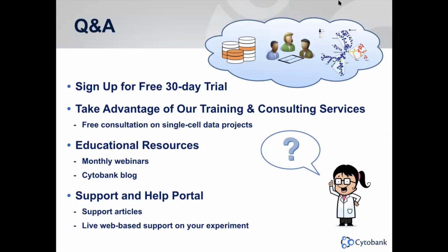Thank you. Yeah, so for Cytobank, we do have the option to make the experiment public if you wish so. We also have some public data that you can test on Citrus on. So just sign up with our premium. You will be able to access the Citrus demo dataset we have now, and you can try out all the functionality yourself.